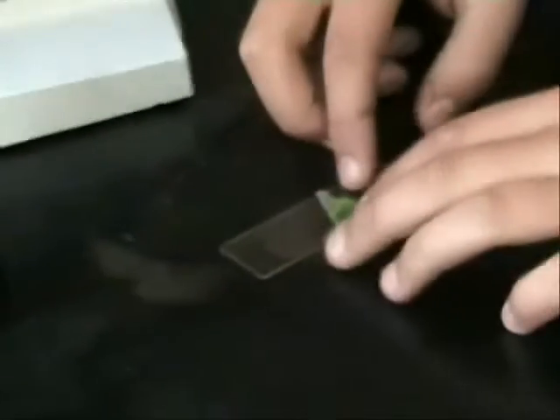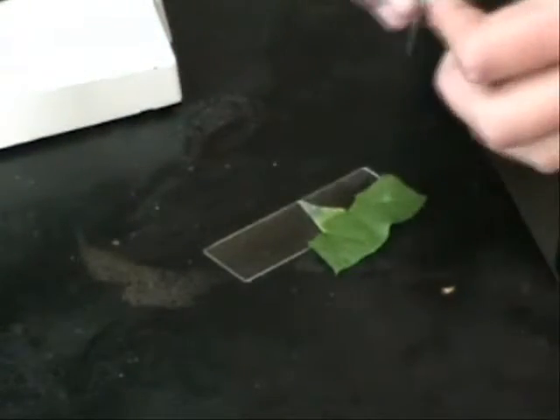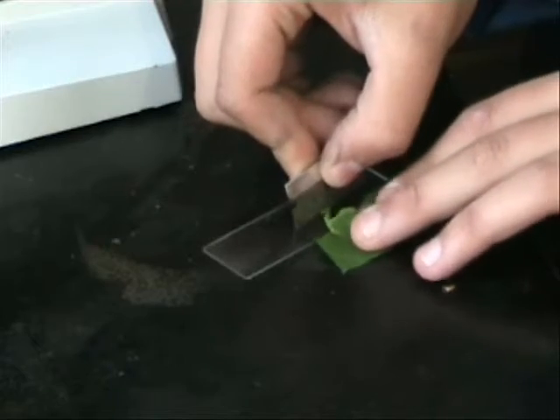The second thing you do is take your rhubarb leaf with the clear part, put it onto your slide, get your razor blade, and cut off the big part, leaving you with a piece on the slide.